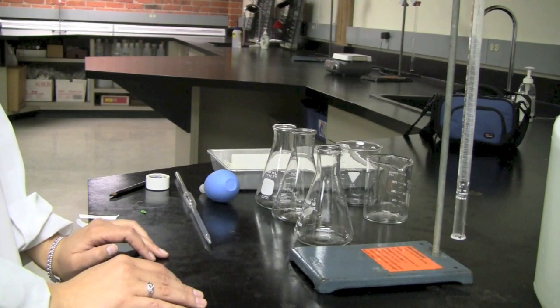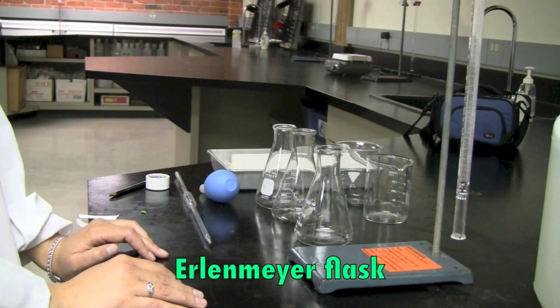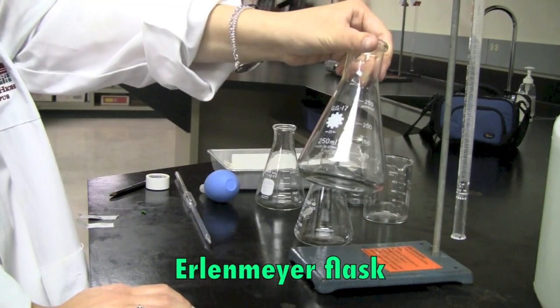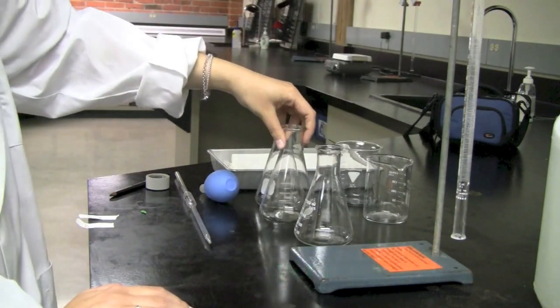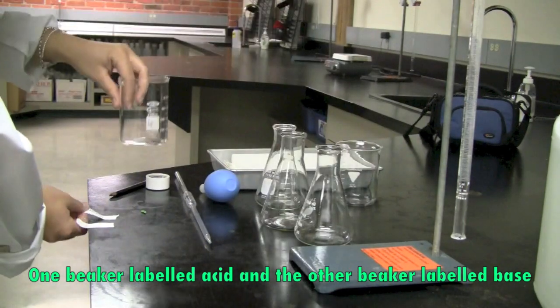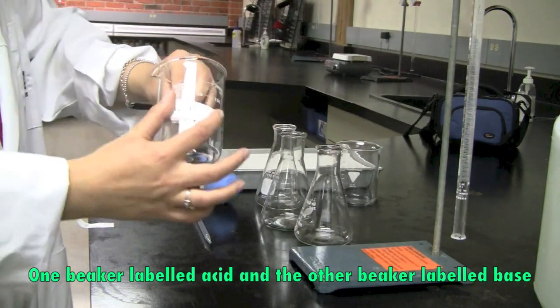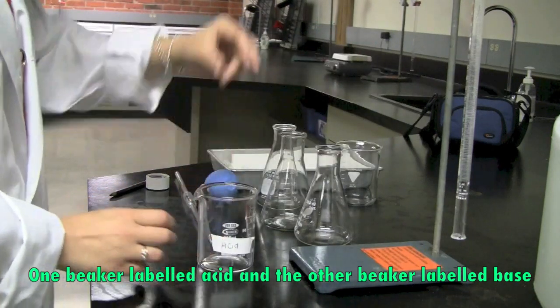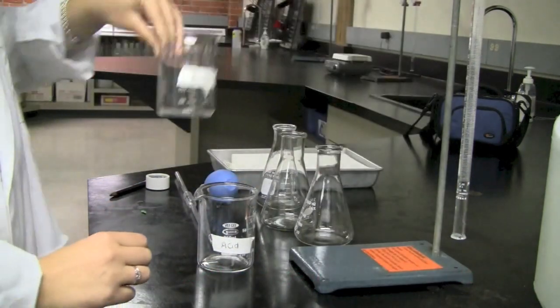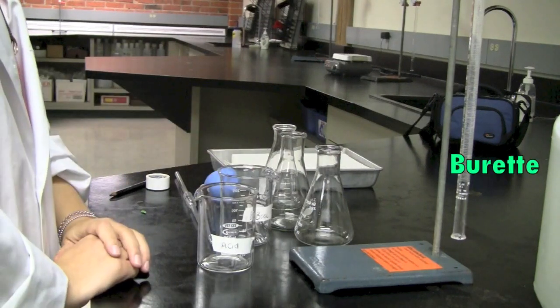So here are some of the materials that we're going to need. We're going to need a 125 milliliter Erlenmeyer flask, a couple beakers, one labeled acid and one labeled base. You're also going to need a burette.